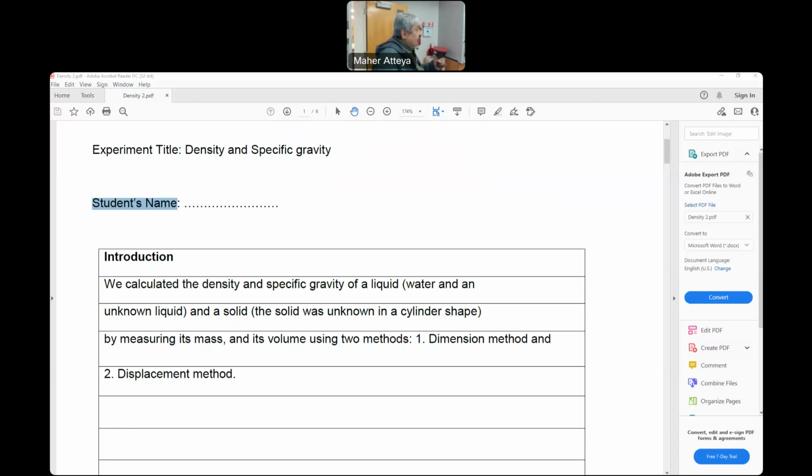So we will measure the volume of a liquid, graduated cylinders with different dimensions will be read, and the mass of glassware will be examined. We did that with the watch glass and the small beaker, and then we have to use the ruler to determine the dimensions of an object. In this case, we did it theoretically there, and then we'll do that with the real object. That's what the whole experiment is.